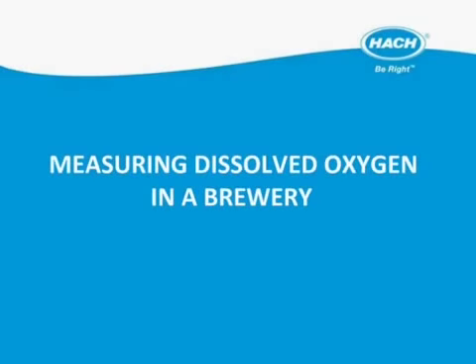Today I'm going to give you a brief overview of measuring dissolved oxygen in a brewery, looking at things from maybe a 30,000-foot view and then drilling down occasionally. What we want to do here is go over an overview. What is dissolved oxygen in a brewery? Why are we measuring it? And how do you measure it?